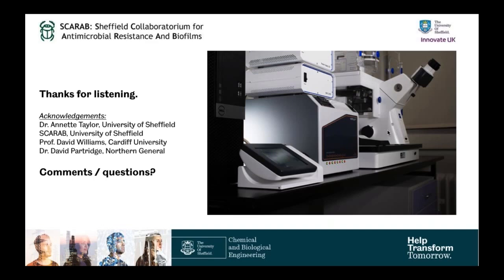And so we have a question here from Christian, which says, what was the most challenging aspect for setting up these experiments on the first go? I would say that, really, because you're working with quite small quantities, it's a very precise system that you're setting up. The most difficult bit is just making sure that you are careful with what you're doing, and that you're very precise setting this up. Actually, the system itself was quite easy to use. The well plate is very straightforward, and it makes sense. So it's quite easy to set up different runs or different setups within one plate. And once you've set up a couple of runs, the whole system makes a lot of sense, and it's quite easy to use.